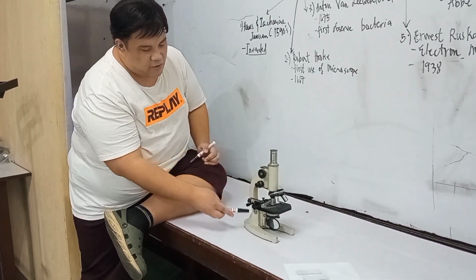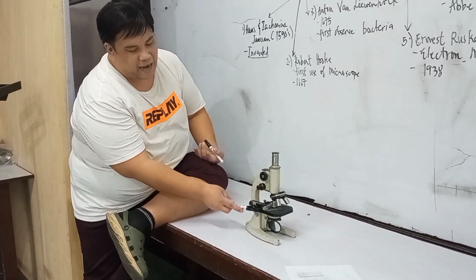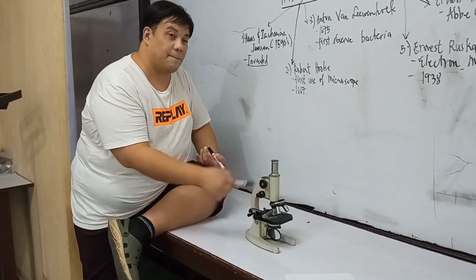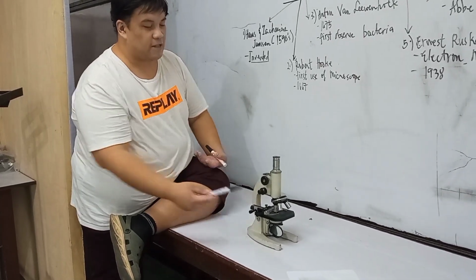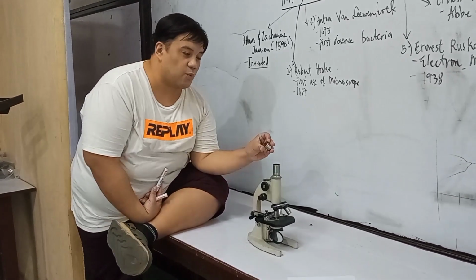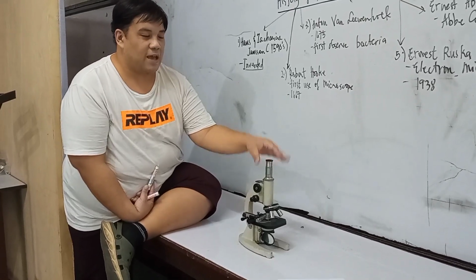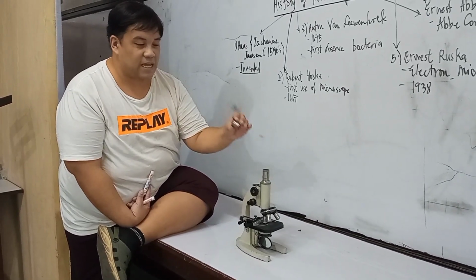From the neck, you have the inclination joint. Yung parang may bakal dyan. And then you have there the base. Those are the mechanical parts. Now, let's go with the magnifying part or observation part. You have there the eyepiece. Eyepiece, I have here 12.5x or 12.5 magnification. We have 5 magnification, 10 magnification, and then ang pinakamataas is 12.5.